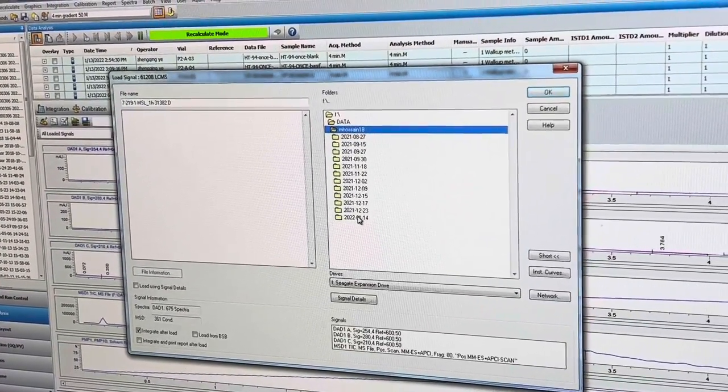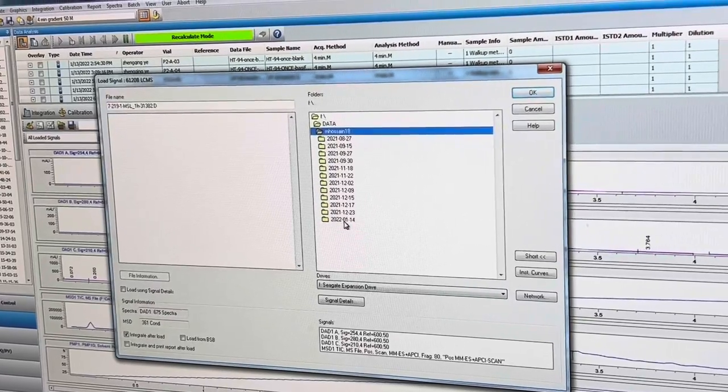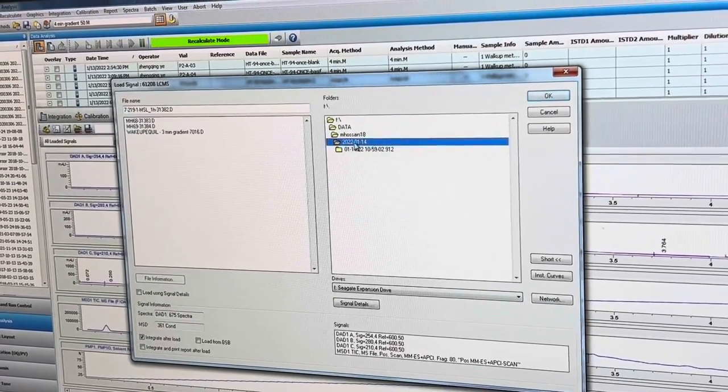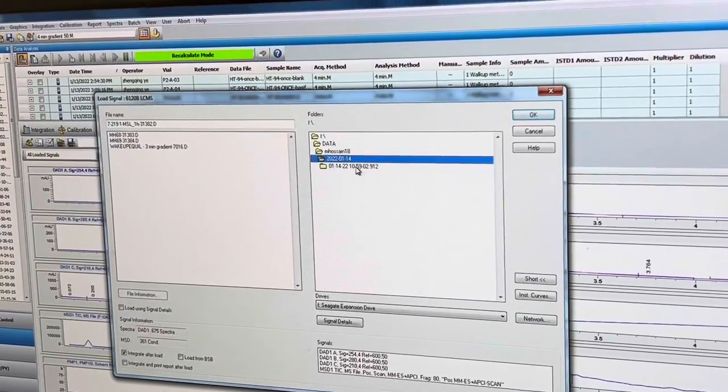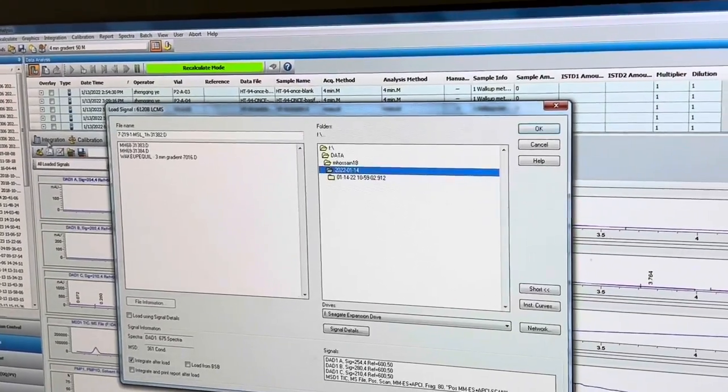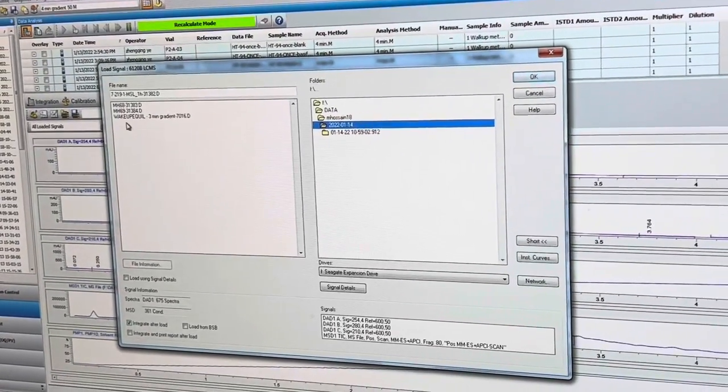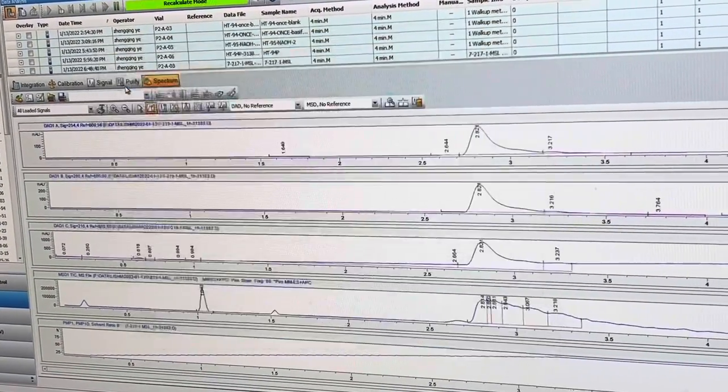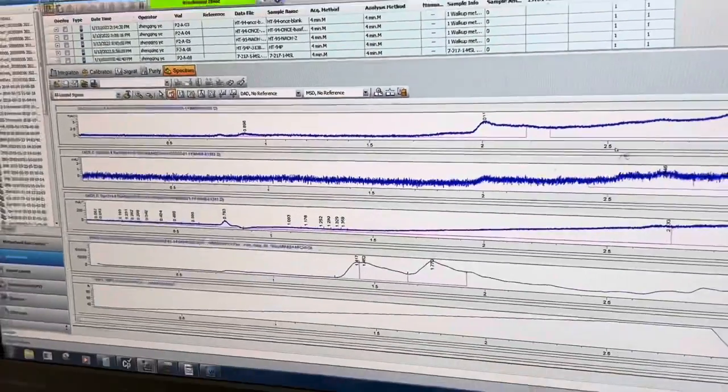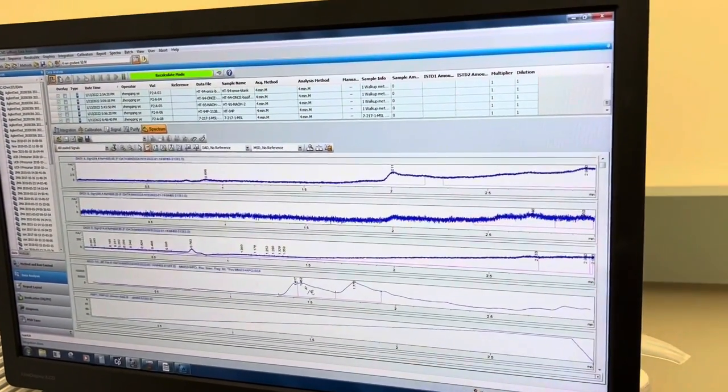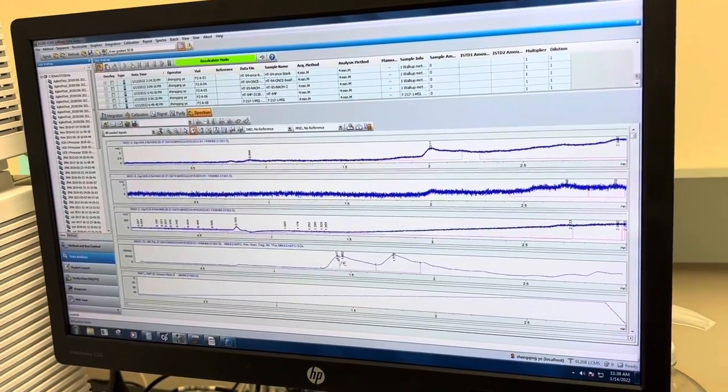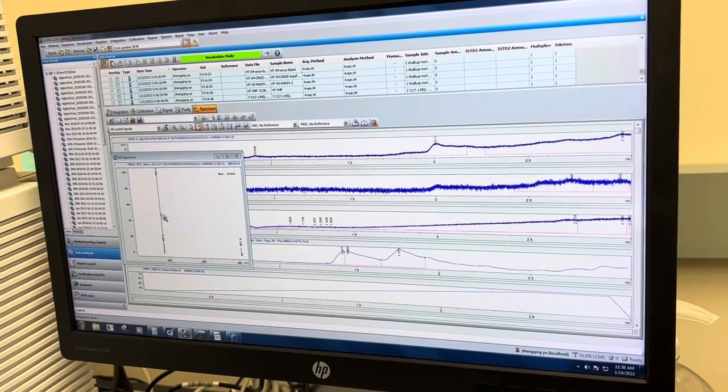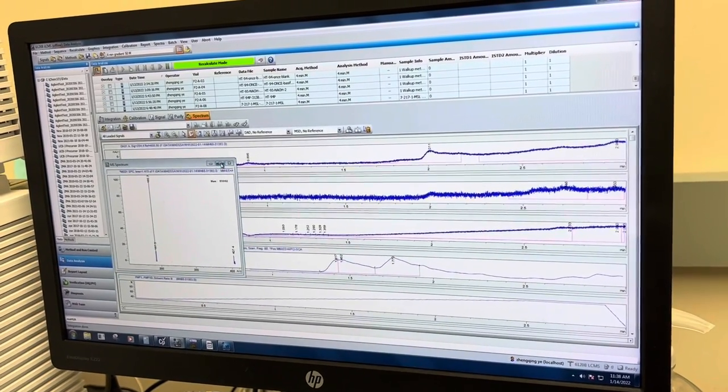Go there and according to date you will get your data, so today I did like this data. So I can double click it and I can see that. And you can click on those peaks and you can see the peak values, okay.